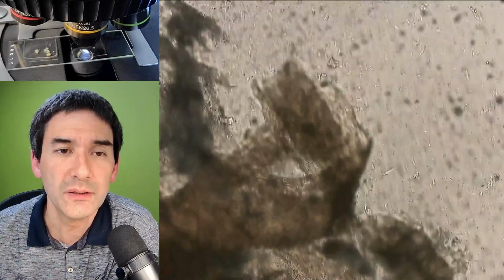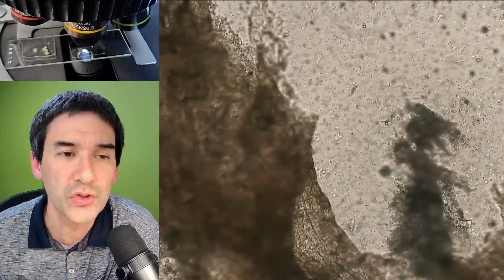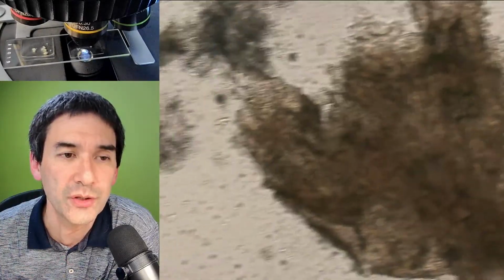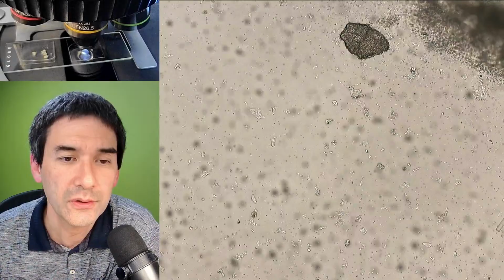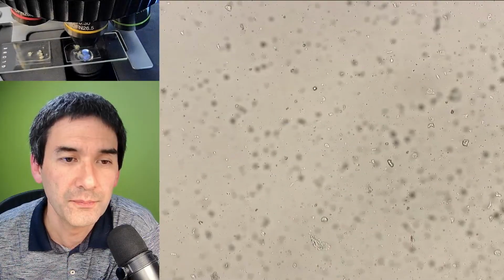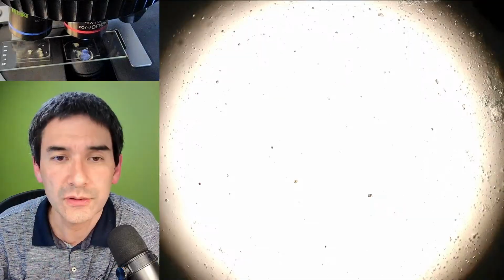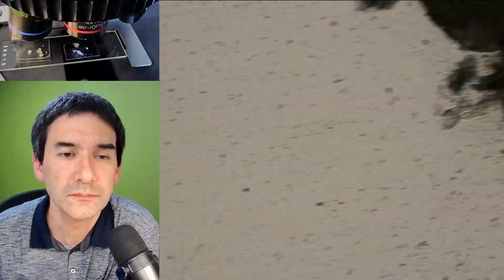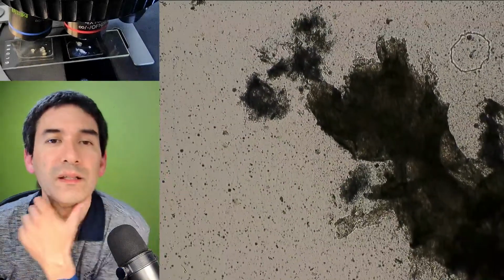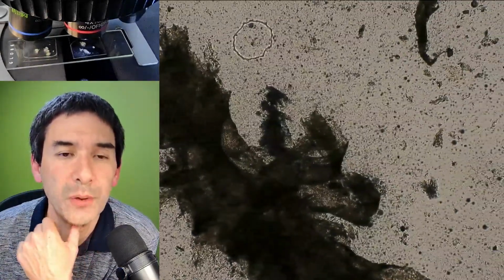This shows how everything is a little bit connected to each other. I probably have to break it apart yet further. Let's go down again with the magnification. My mistake here is I did not spread it apart enough.